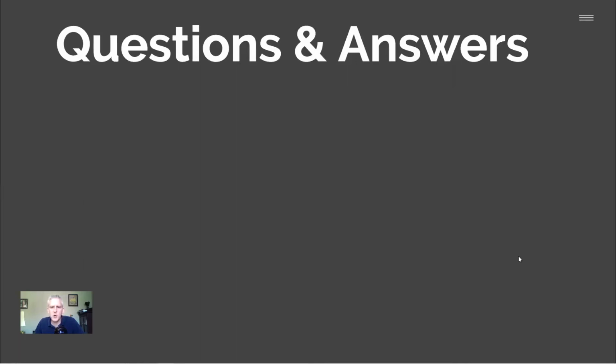Next question. So ROI Painter in 3D treats transparency as the defined range of 2D. Yeah, that's one way of thinking about it. So when you adjust the brightness and contrast, you are doing exactly that. It's like you're using define range, but it's an on-screen visual feedback: just pixels that are not transparent are the only ones that can be selected.